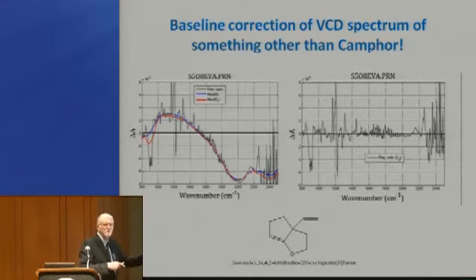But in terms of the noise spectrum, that's pretty much random noise which gets bigger at the ends of the spectrum. So my question is, can you modify your algorithm somehow to recognize that very, very sharp bands that are resolved bands from the water vapor, somehow just ignore them, or take them out?